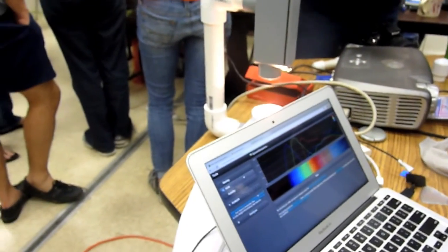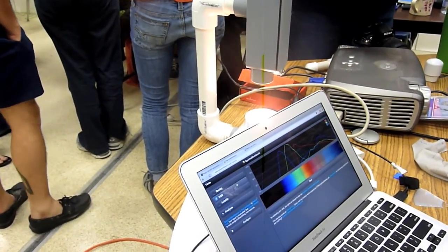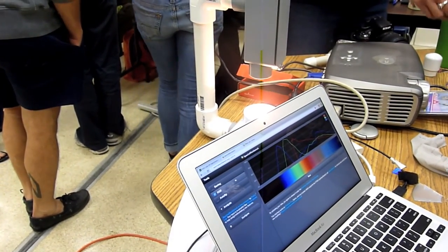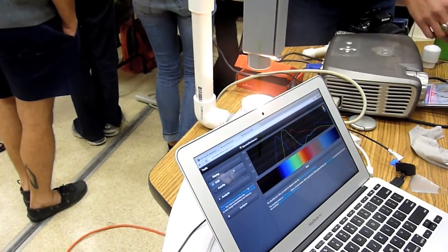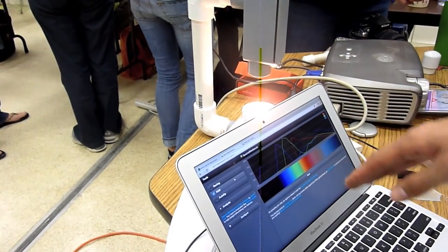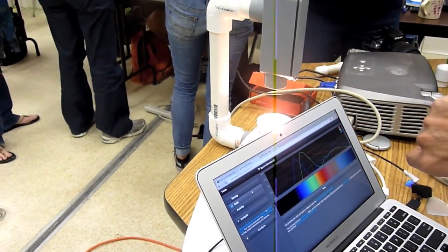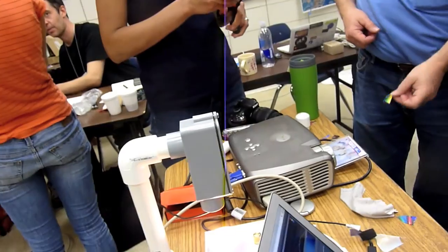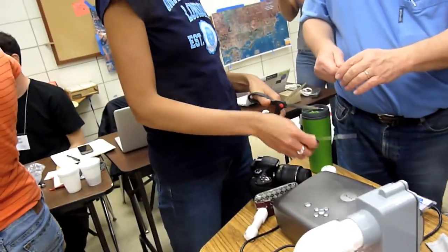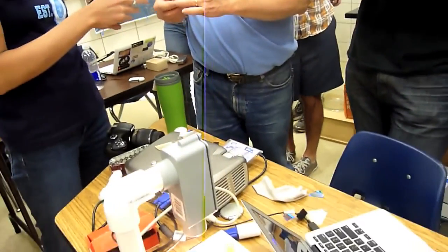And what is that a spectrum of? That's of this particular source, that light. Xenon light. And what's a good characteristic of xenon? It's really white. It has an even spread of color. There are no missing gaps, and it goes pretty far into the ultraviolet and the infrared, so it's especially wide. But honestly, I haven't seen a big difference qualitatively. Yeah, and that's why we would use these. This would be the only one. I think once we get into it, the other is a lot easier to cut.